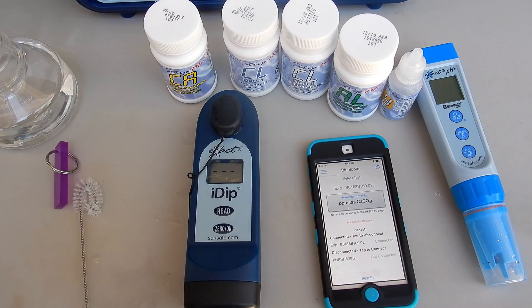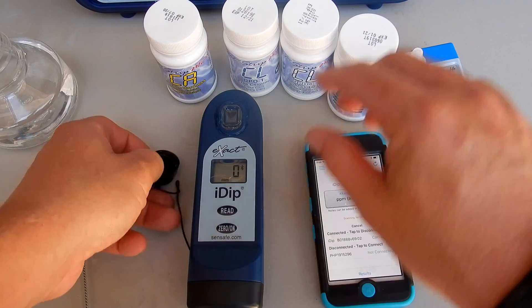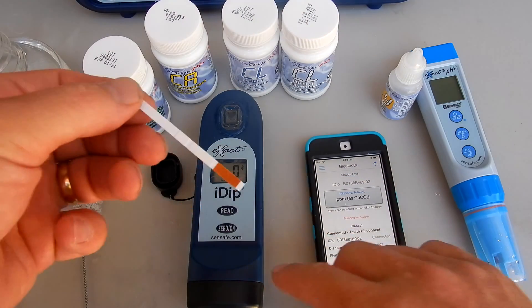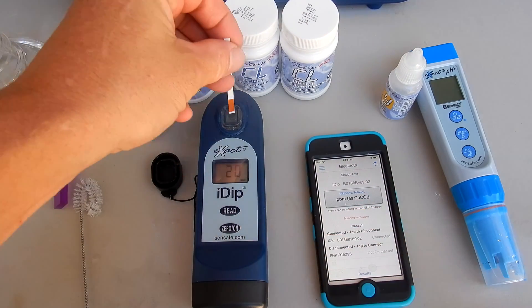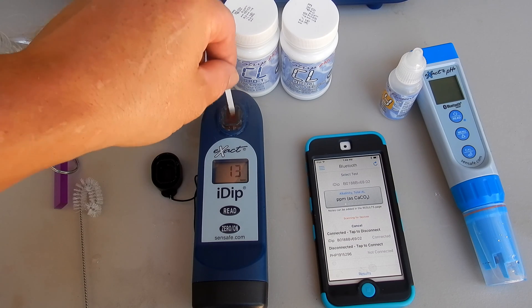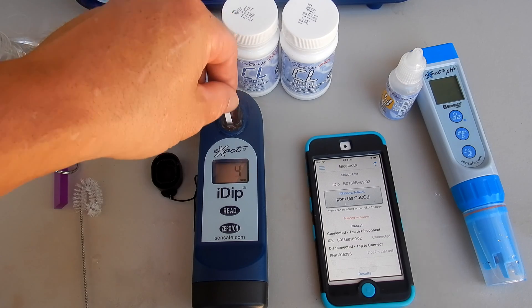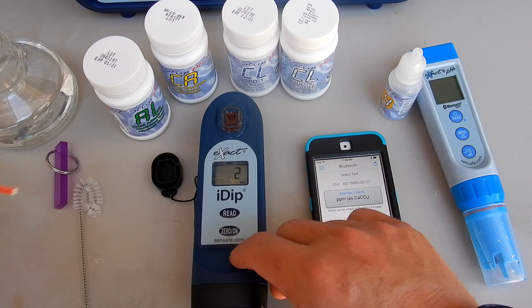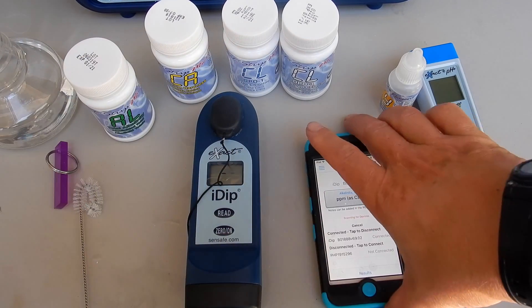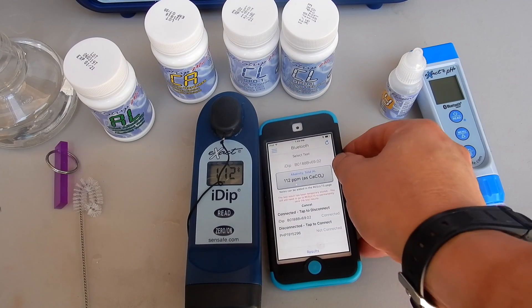Now we're ready for testing. Get the alkalinity test strip, hit read, dip the strip in, and move it back and forth — about twice every second. This is how the reagent is released into the chamber and the photometer reads it. You'll do this with all the tests using the test strips. When it gets down to one, put the cap on. The alkalinity is coming in at 112 parts per million. As you can see, the testing with the Exact iDip is very easy.